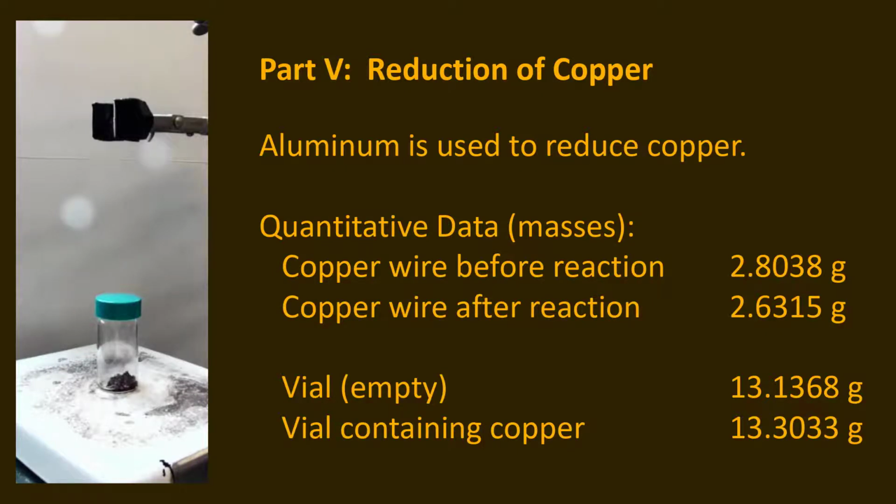The answer to that question, or the hope, is that we keep that oversized cap on top of there, and also we rely on the fact that as this organic solvent, that last half a milliliter or whatever, is boiling away, it's refluxing. So it boils, and the vapor is constantly rolling back down and recollecting inside of this container.